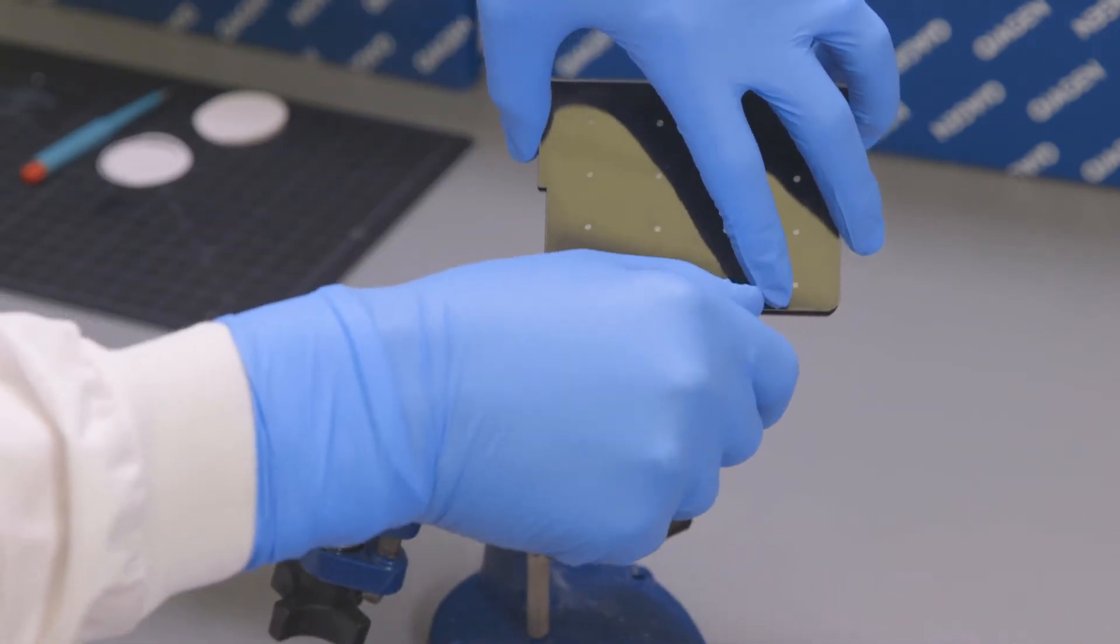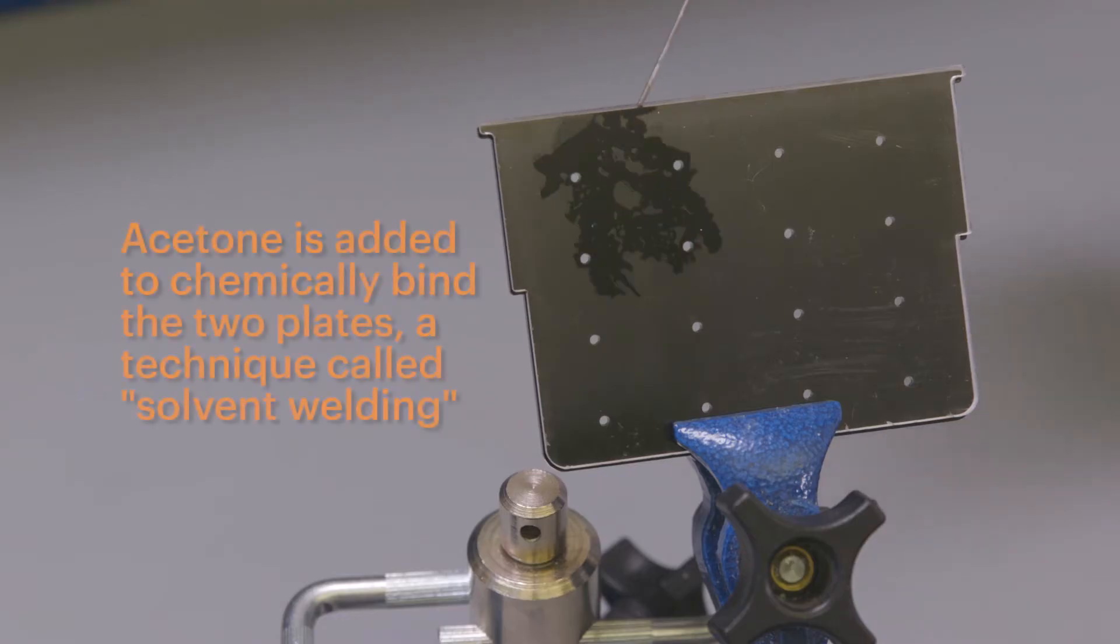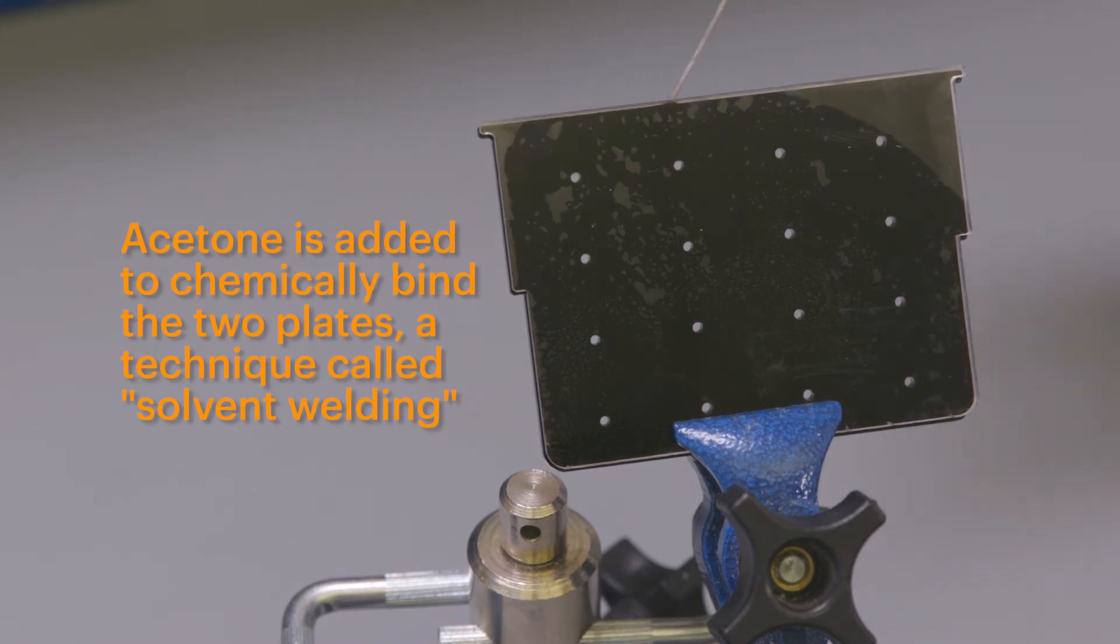The top piece is black to prevent crosstalk between wells. The bottom piece is clear to allow light to shine through each reaction.